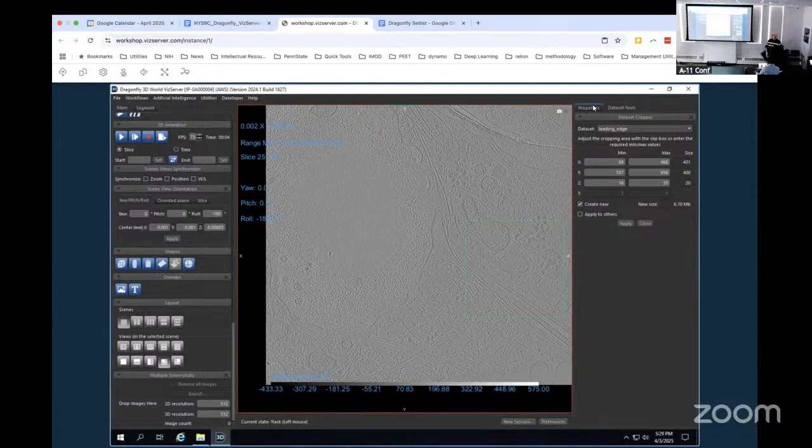Once you apply the cropping region, is there a way to get the green box back, or do you have to undo the crop? You mean fully expanded? Like, I cropped the first region, but now I don't know how to move it to a different one. Sometimes the box disappears. Yeah, and I don't know how to find it all the time. This is just one of the quirks of this thing. Perfect.